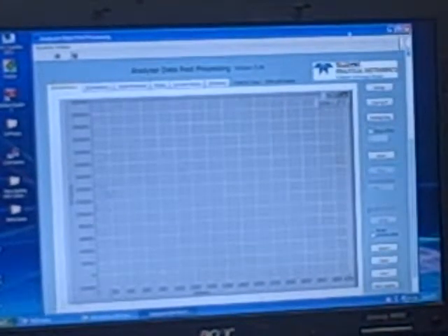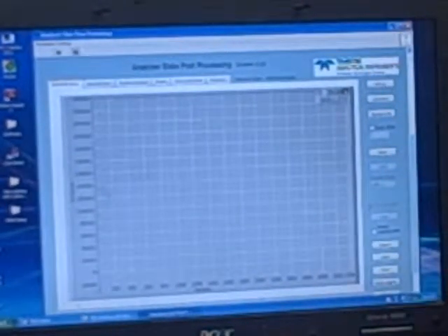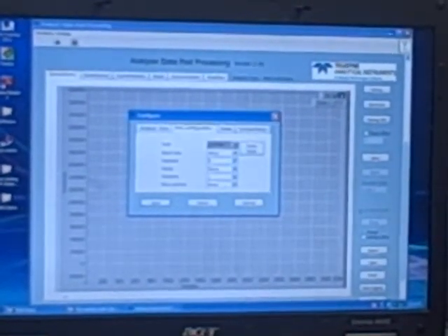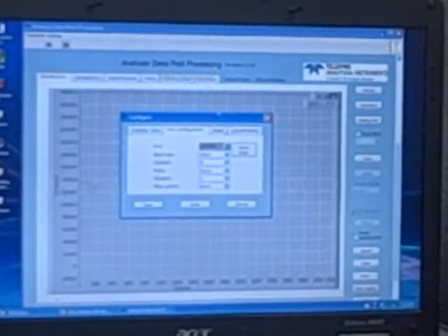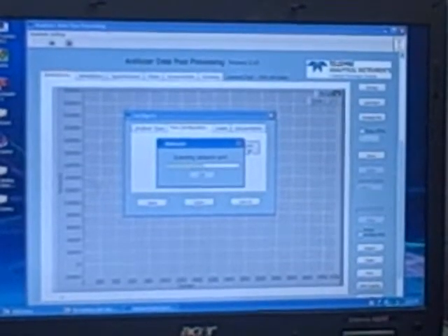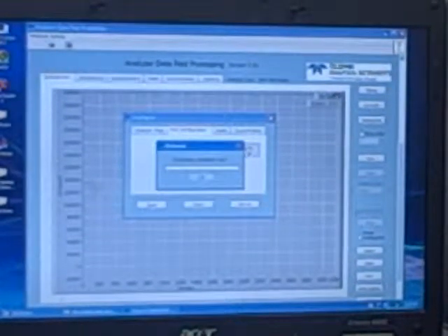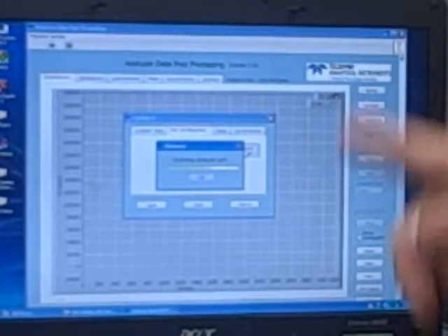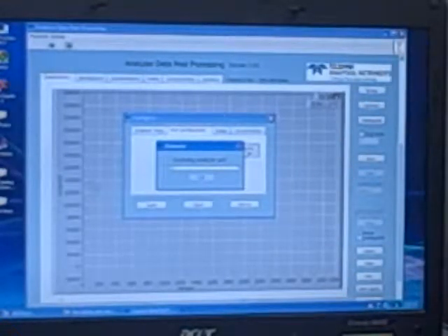First, you open this program. Second, you go to the setup. Then you find port configuration. You do not have to worry anything but just click auto scan once. The software will automatically tune into the right protocol or communication setup. Okay? If you do it manually, it will be a long time. Now it's automatic because you have to find what COM port is using and what baud rate the communication port protocol is using.